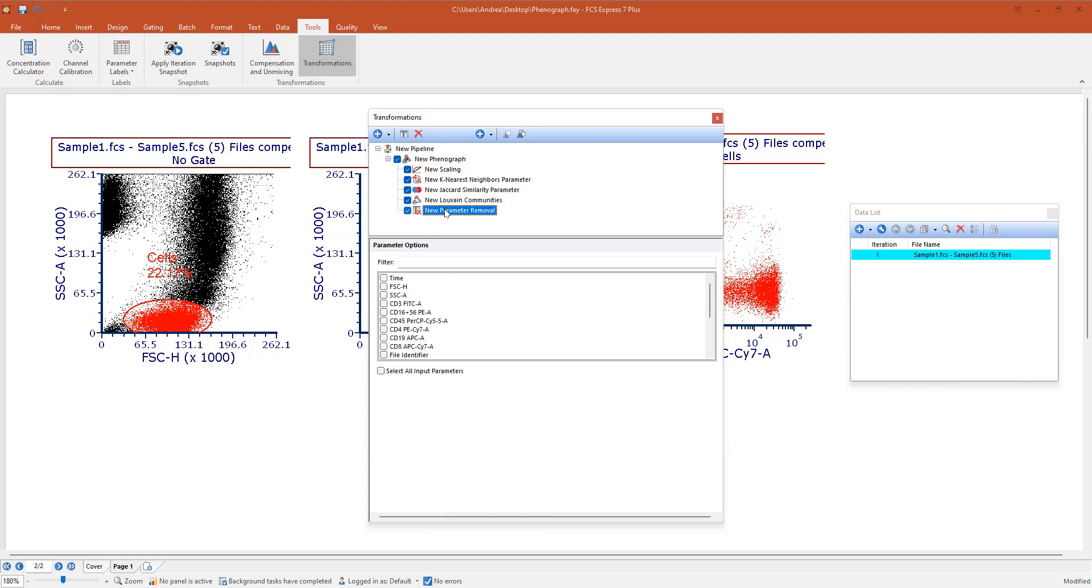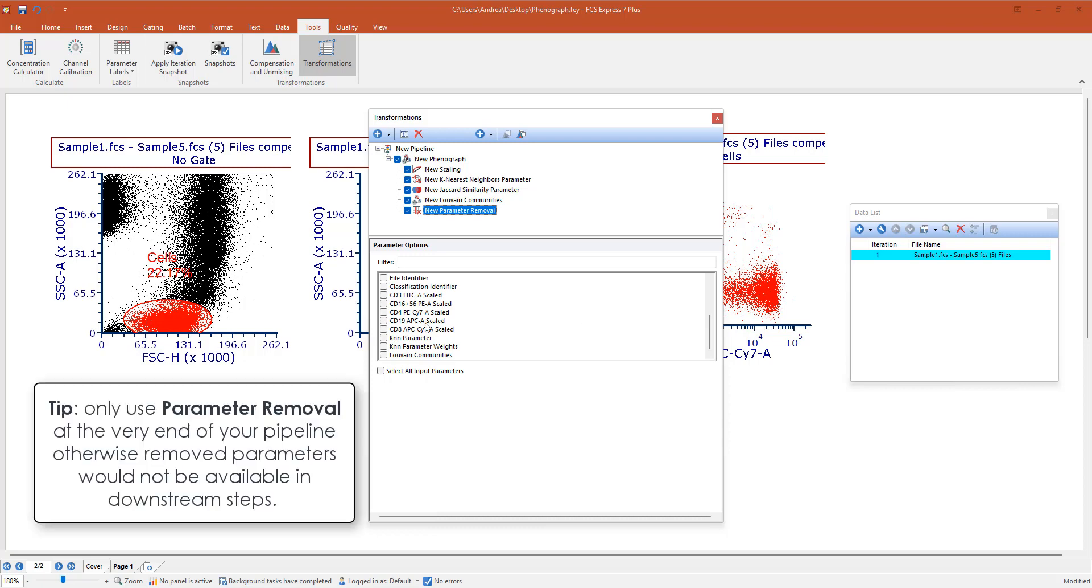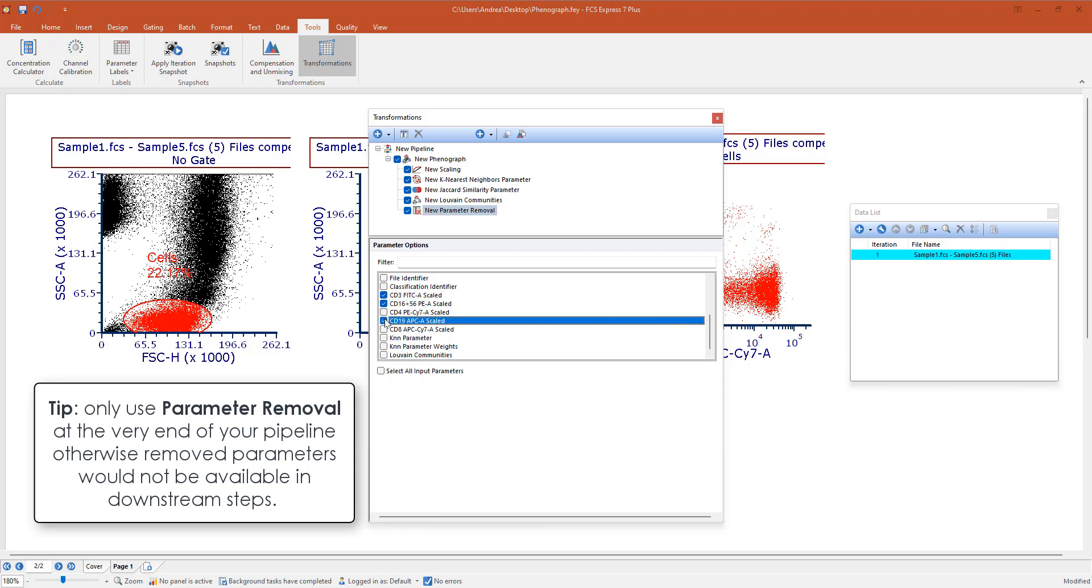We have a final step which is automatically created when adding a Phenograph predefined algorithm, which is the parameter removal. This is optional and this is basically hiding all the parameters that are selected here in the parameter list drop-down menu on plot. If I don't want to make that list too long, I can remove them so that they will not be visible.